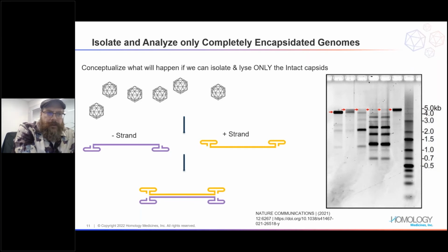The way we go about investigating and confirming that what we've designed is actually what we're getting into our capsids is that you take your capsids and break them open, so you lyse your capsids. And now, through the wonderful miracle that is hydrogen bonding, you will reanneal a vast majority of your population of positive and negative strands to get the appearance of what we have at the bottom with the little doggy bone there, ready to go into your canonical SMRTbell sequencing, where you anneal your SMRTbells on either end at the opening and you sequence it.